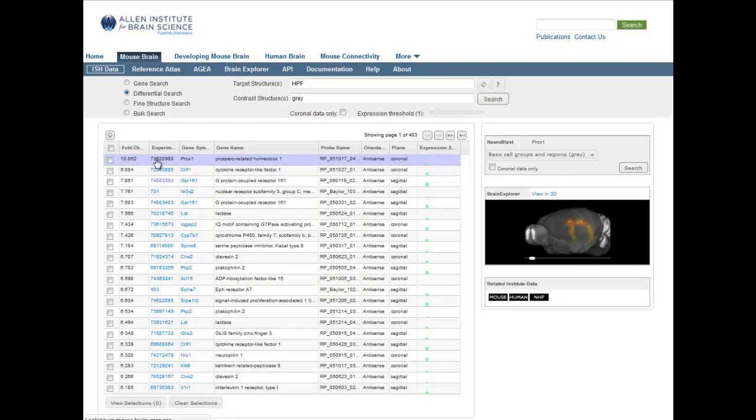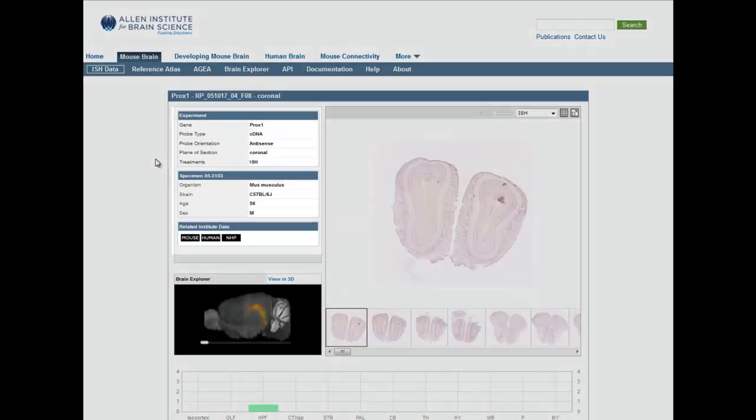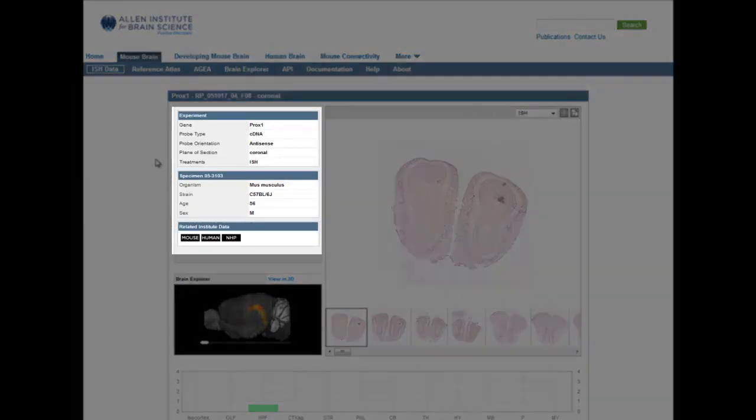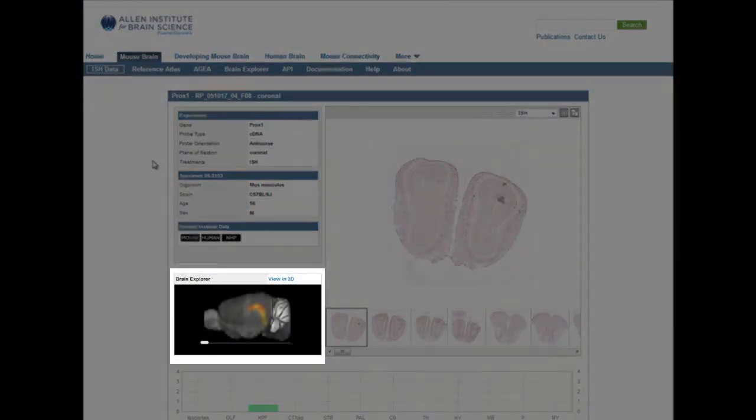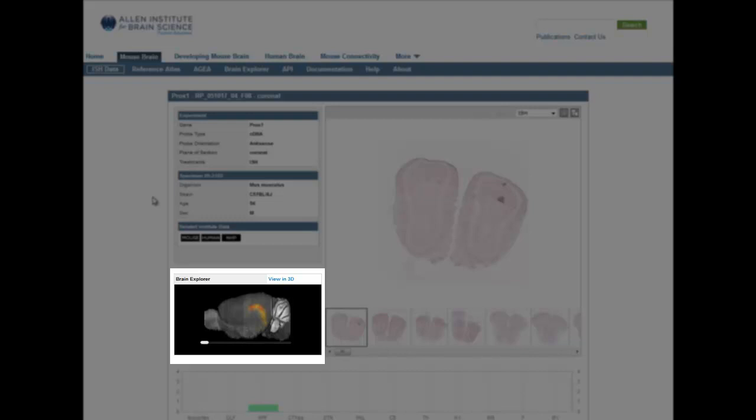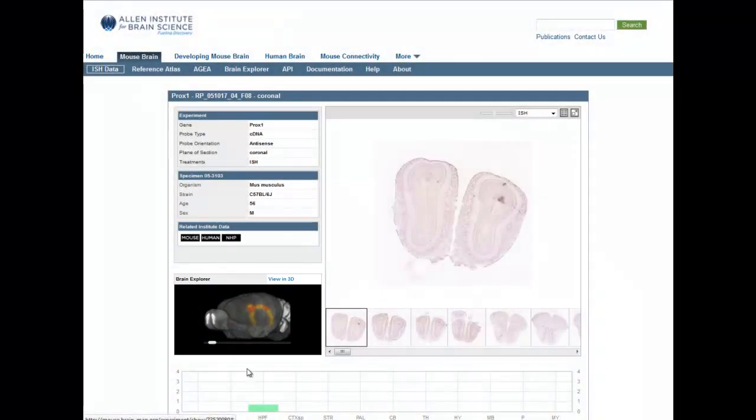More detailed experimental information is available by clicking the Experiment link. The Experiment Detail page includes metadata as well as links to other Allen Institute projects on this gene, a 3D thumbnail view of gene expression, and an image viewer of the entire experiment.